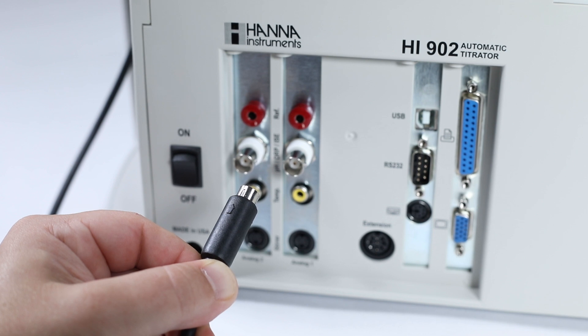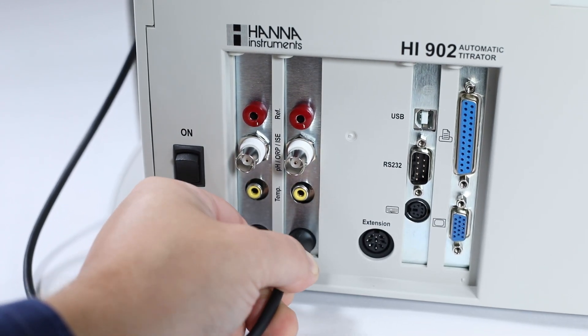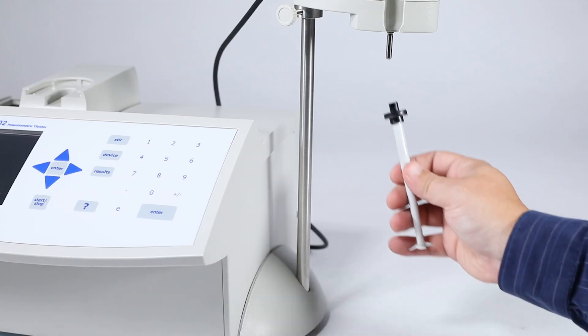Do not force the plug into the port — the cord is labeled with the proper alignment. Once you have that secure, insert the propeller into the stirrer and put the temperature probe into place.